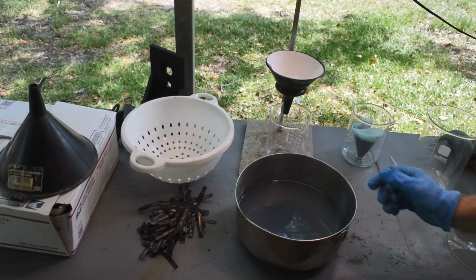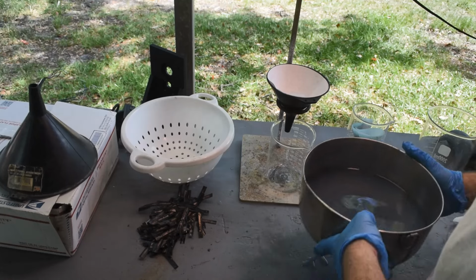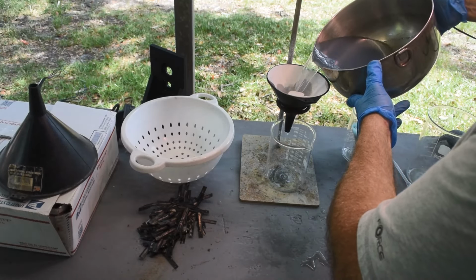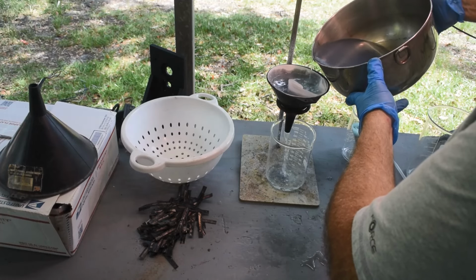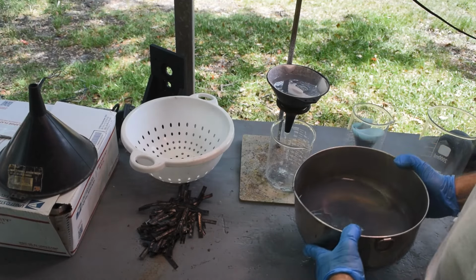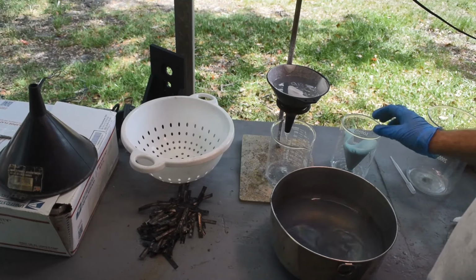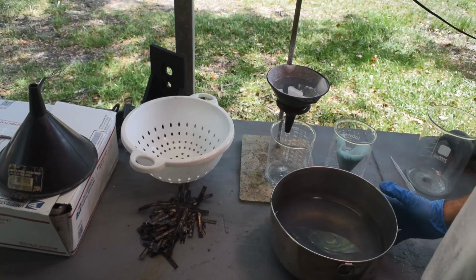Okay, we got pretty much the same setup going on as before. Just going to pour this liquid off through this filter, capture all the palladium, and again, this can probably just be a coffee filter. I don't see any reason why it can't be. And then we'll have all the palladium on two filters. This is the first filter. This will be the second filter.